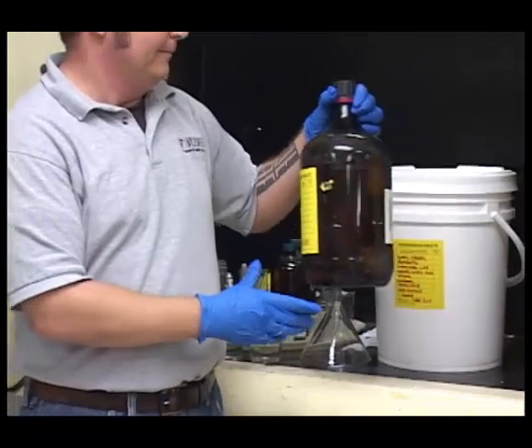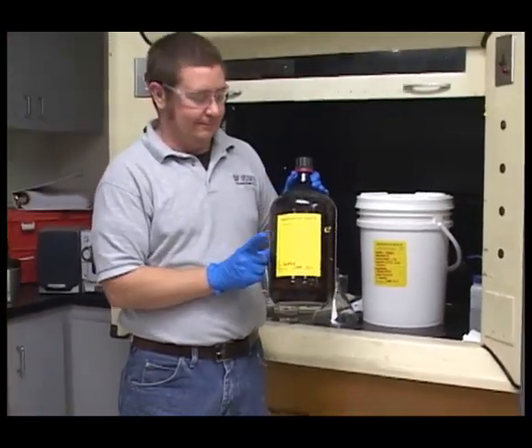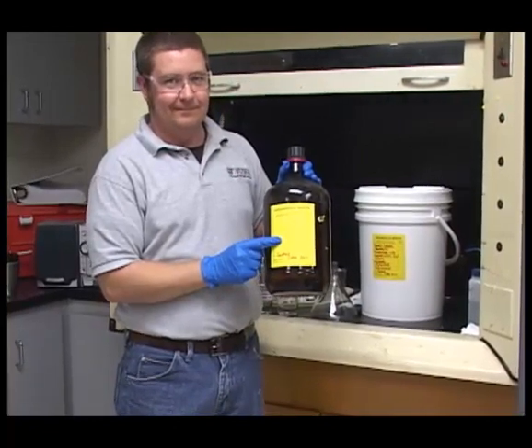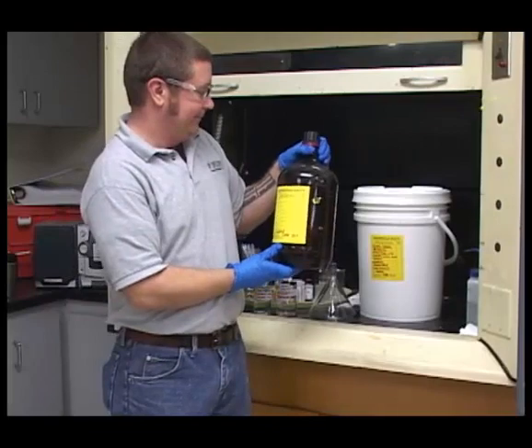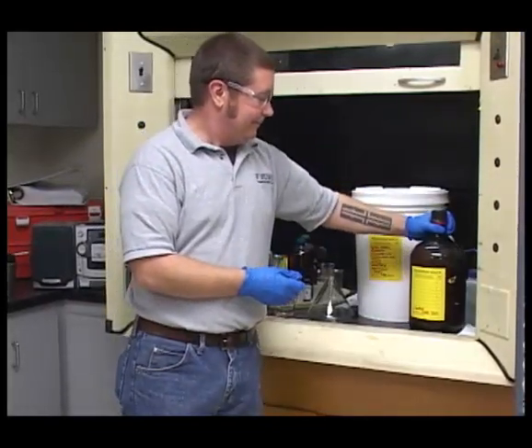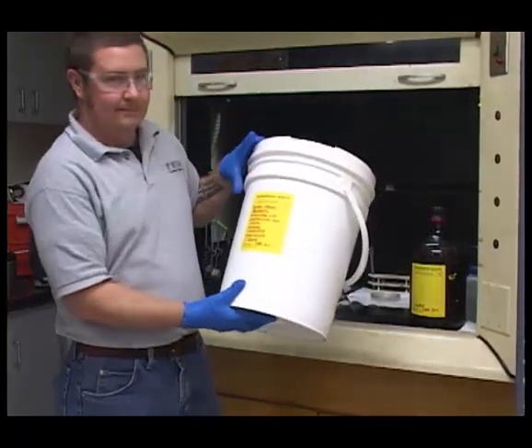The best practice that you can have in your laboratory, which will help ensure compliance with the EPA's labeling regulations at all times, is to do one simple thing in your lab. Put your labels on your waste containers before the first drop of liquid waste or the very first pair of waste gloves goes into the container.